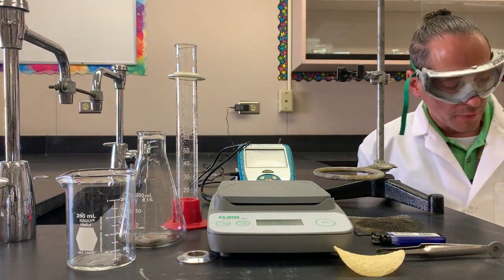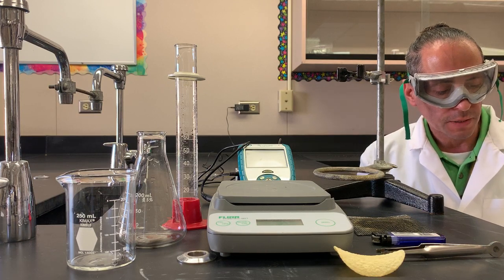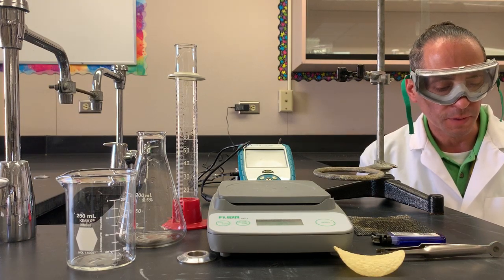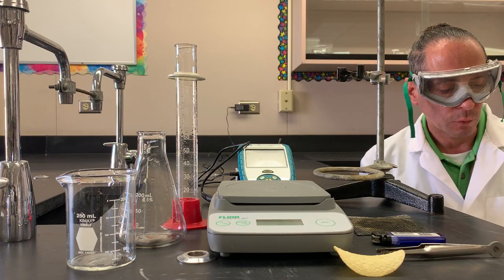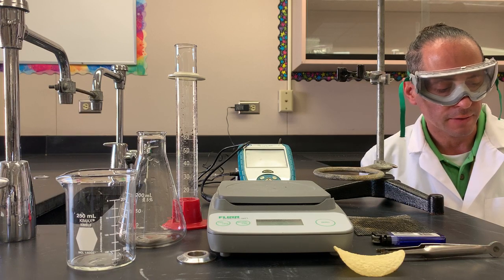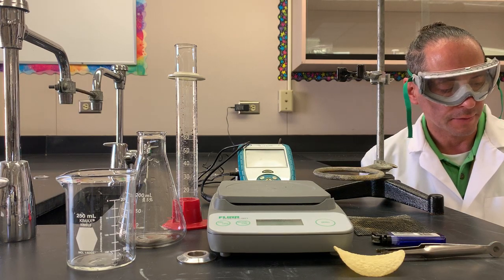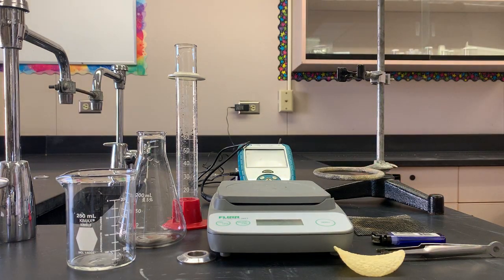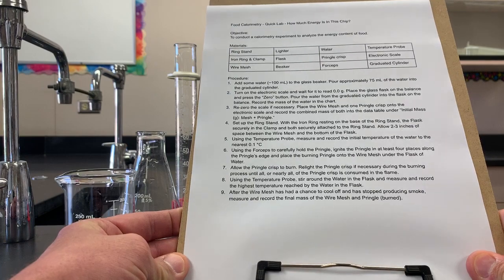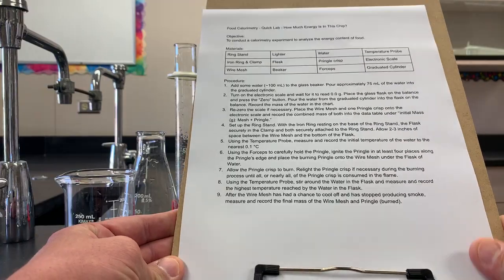Our procedure has nine steps. Step one: add some water, approximately 100 milliliters, to the glass beaker. Pour approximately 75 milliliters of the water into the graduated cylinder. Turn on the electronic scale and wait for it to read 0.0 grams. Place the glass flask on the balance and press the zero button. Pour the water from the graduated cylinder into the flask on the balance. Record the mass of the water in the chart. Re-zero the scale if necessary. Place the wire mesh and one Pringle crisp onto the electronic scale and record the combined mass of both into the data table under initial mass, grams, mesh plus Pringle.